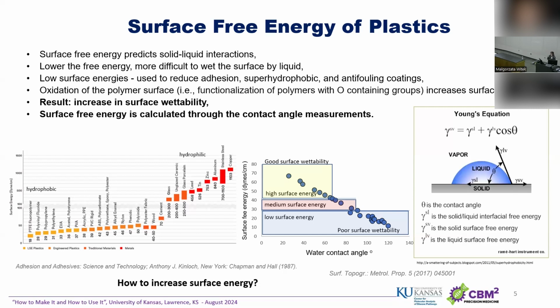We want a lot of interaction of the biological fluid, the buffer, or whatever standard solution with the surface. So you can see that here you have a surface energy. Those are low surface energies, which means this is a hydrophobic surface.